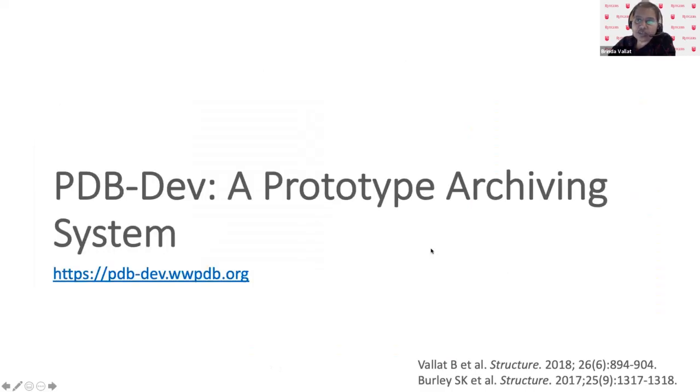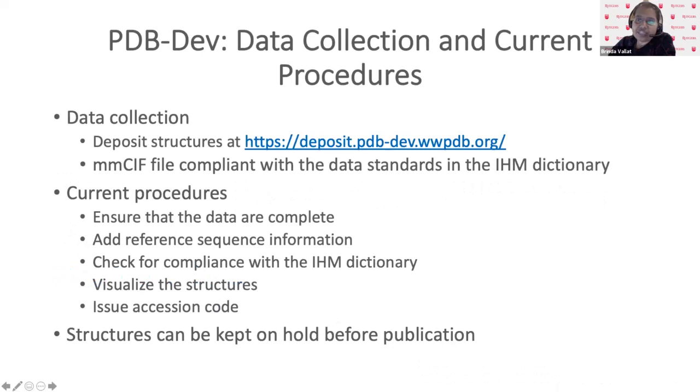Next, we move on to the second requirement, which is the creation of an archiving system. We've developed PDB-Dev, which is a prototype system for archiving integrative structures. The data standards for PDB-Dev are provided by the IHM Dictionary. PDB-Dev data collection and current procedures.